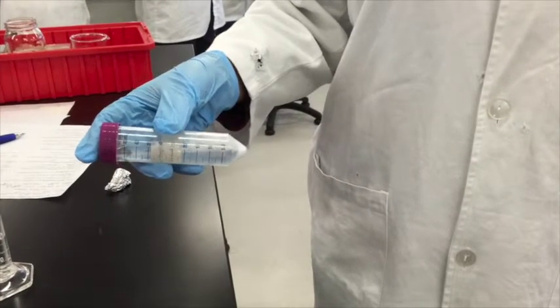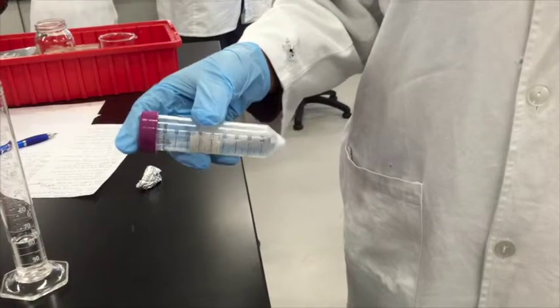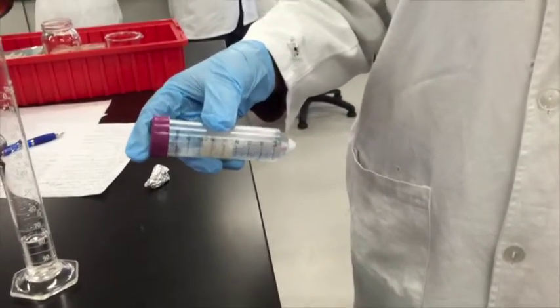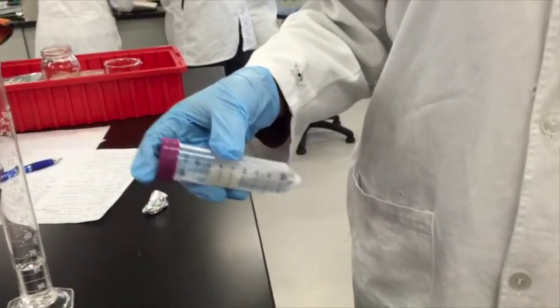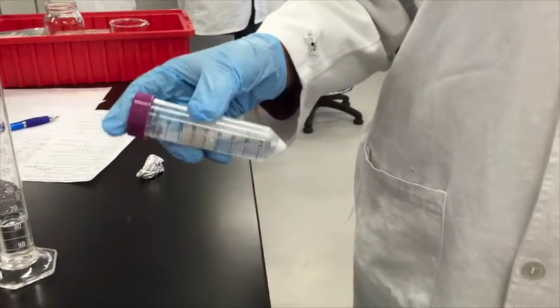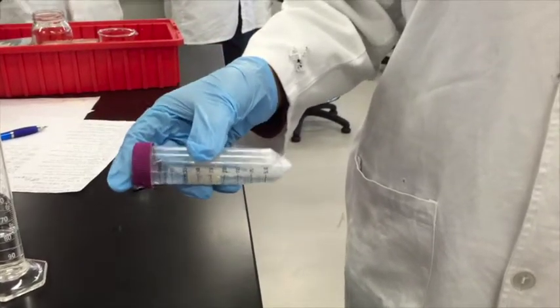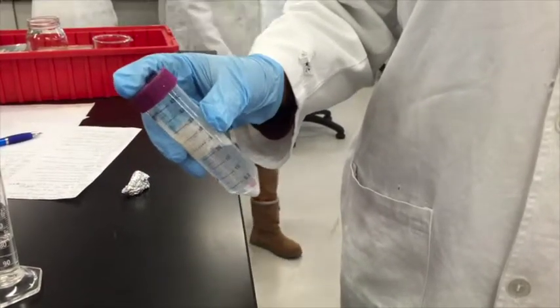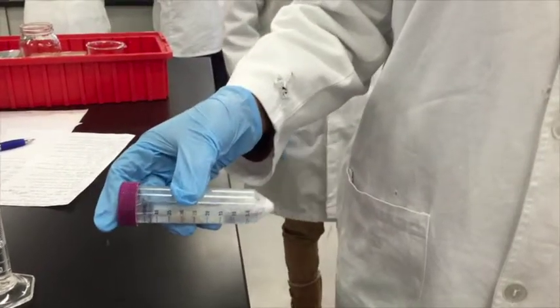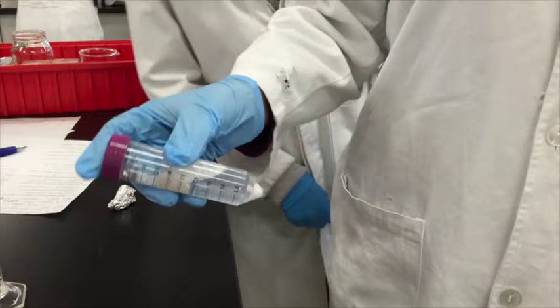Some of the points we needed to consider for making the mixtures were having the correct compounds, checking molecular weights, having the correct calculations, having the necessary material, making sure the material was clean, knowing which instruments we were going to use in order of the sample we were going to take, using the pipettes correctly, following the instructions of preparation labeled in the original container, using gloves and masks when necessary, and also labeling each of the solutions made in order to know what is in the container and also when they were made.